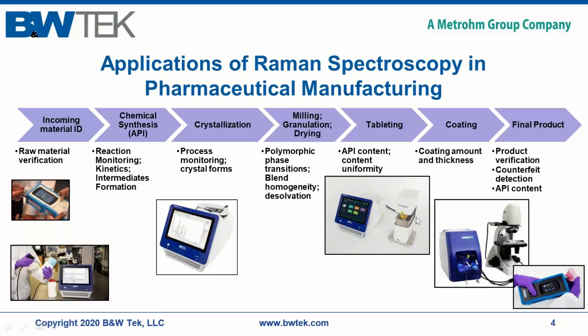So you can measure tablets, solid dosage forms here, and you could put powders into bags and measure them as well. But if you are going to be measuring predominantly powder blends and such, I would recommend a different configuration than the Transmission Raman. I would use the fiber optic probe and go directly through a plastic bag into the powders.